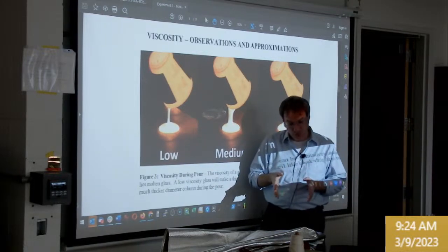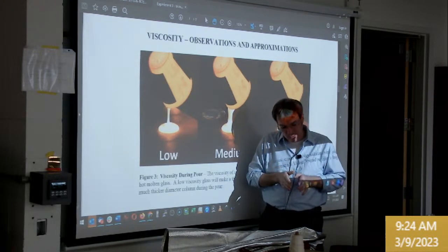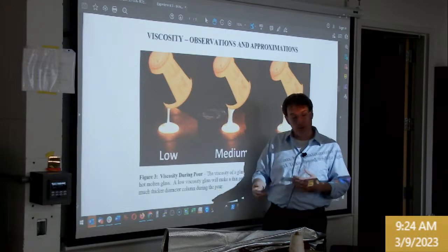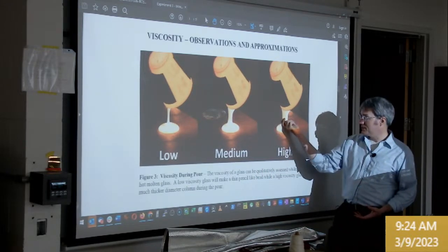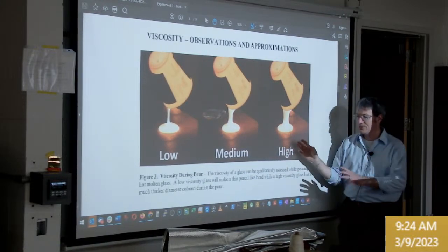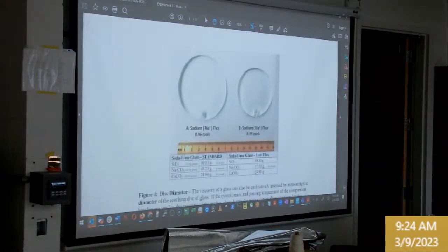Some of them, you turn the crucible upside down and you wait for several seconds, and then this blob of glass slowly exits, where for the borax glass, it's actually exiting almost instantaneously. But the thickness as it exits is a visual clue to a qualitative assessment of viscosity, low, medium, high for glass.